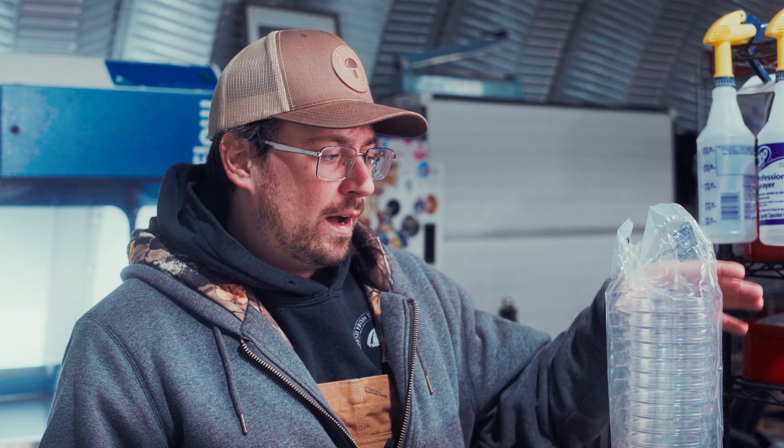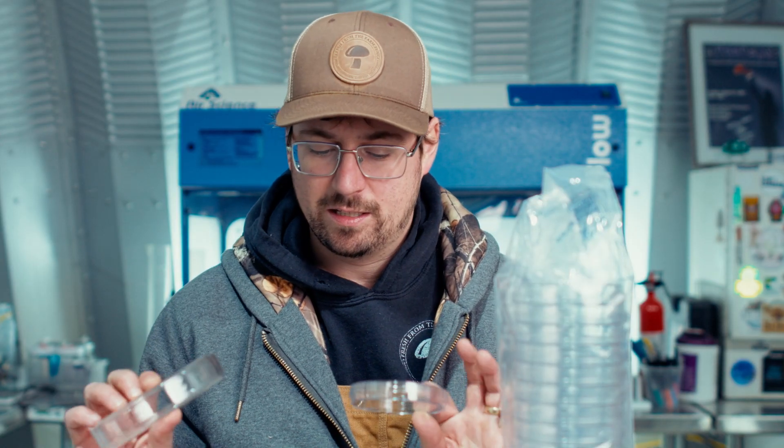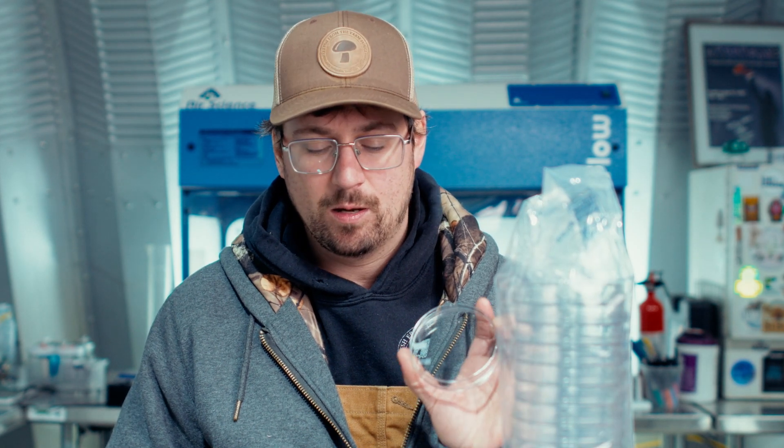Another pro of the plastic dishes is that they're very lightweight compared to the glass dish. If you're going to be pouring a bunch of plates, handling them, or shipping cultures, plastic is the way to go just because it's so light.